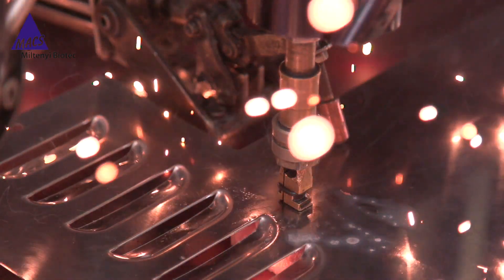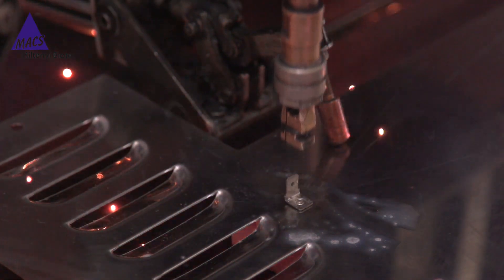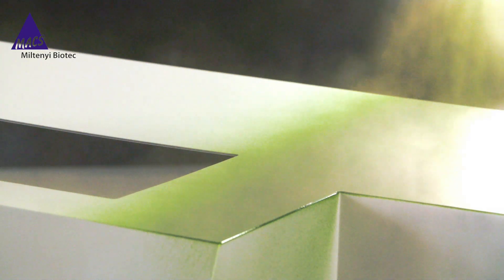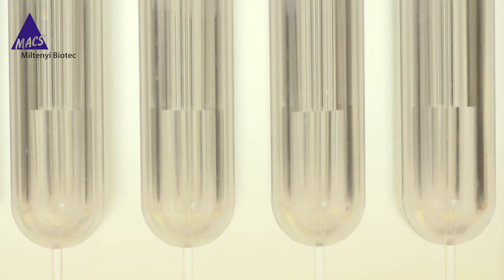What if you could analyze 384 well plates in 60 minutes? 96 well plates in 15 minutes? A single sample in under 10 seconds?